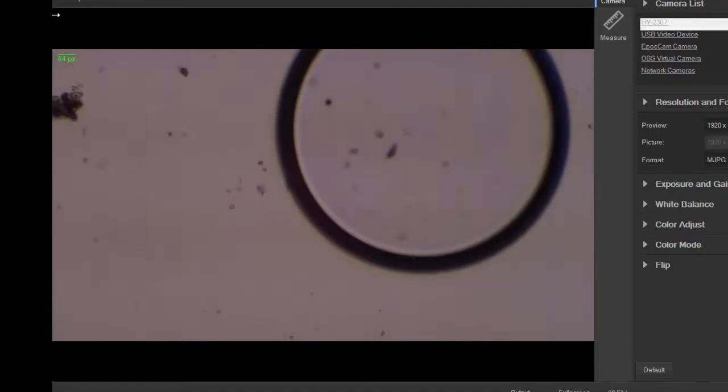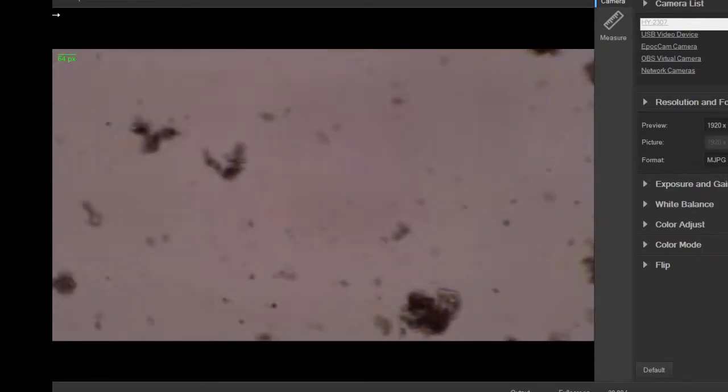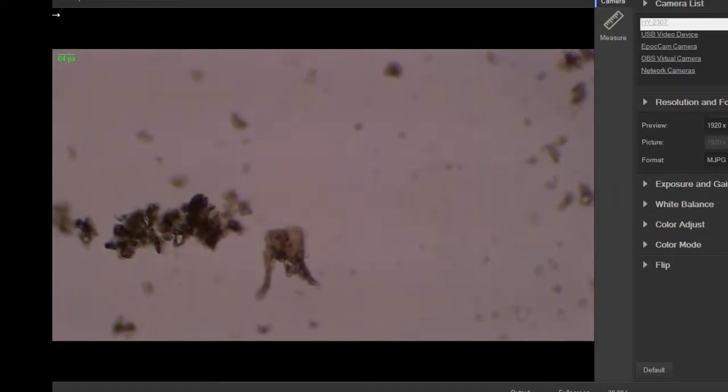Alright, let's go lower and find those. This water level's moving fast. I don't get these things before these guys get squashed. Where are you guys? You're still swimming up here?